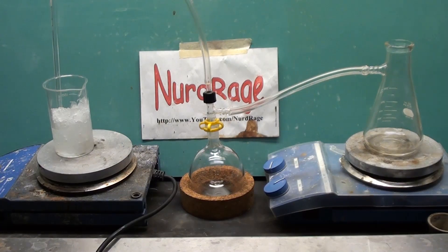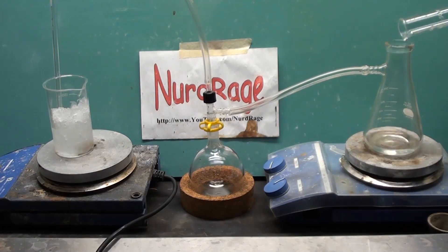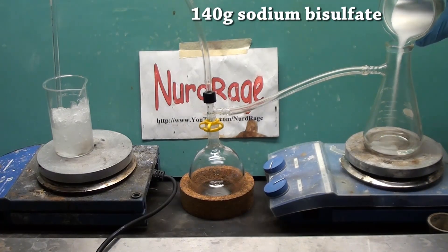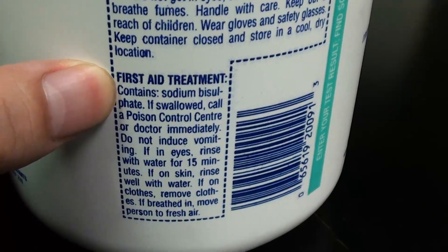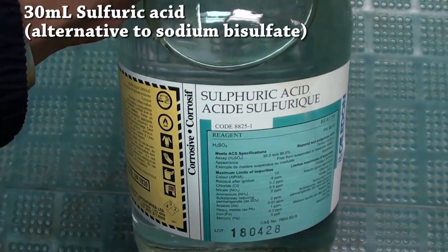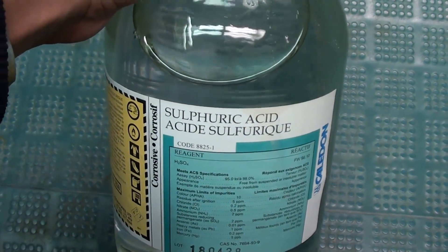To generate the gas we first put about 20mL of water into the generator. The water is optional and can be omitted if your hot plate is hot enough. Now you add in 140g of sodium bisulfate, which is sold as a pH lowering chemical for swimming pools. Be sure to check the label to make sure you have the right stuff. You can also use 30mL of concentrated sulfuric acid, although if you had access to that you probably wouldn't need hydrochloric acid.